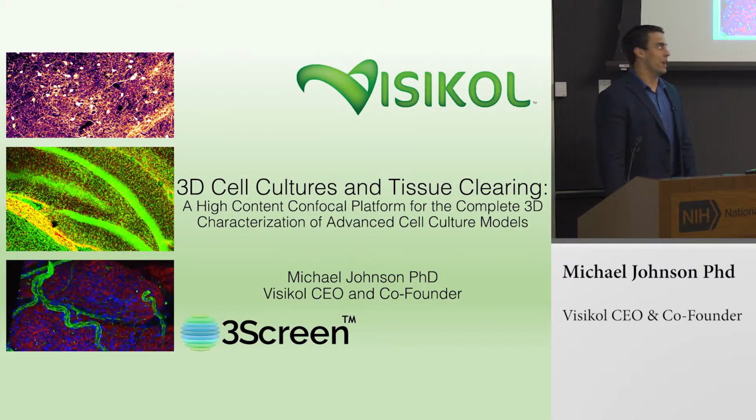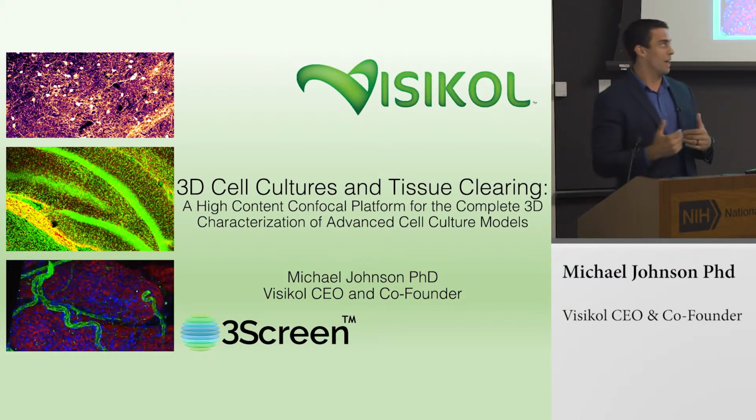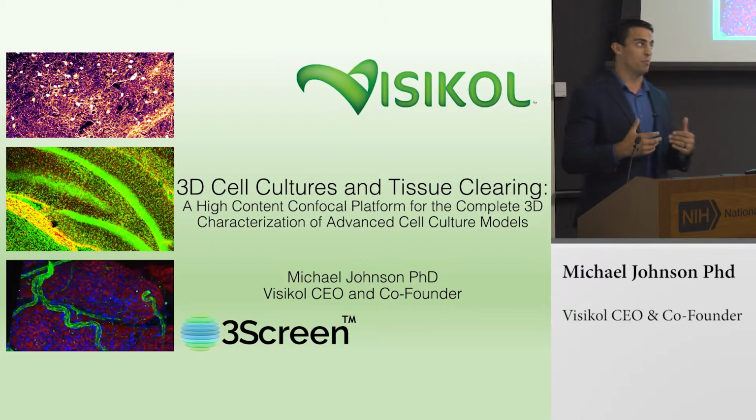So yeah, the presentation today I was going to go through is a high-level overview of 3D cell cultures, talking about some of the applications that our lab has worked on, and also diving into tissue clearing and how it applies to 3D cell cultures. It's something we've heard about in whole mouse brains, whole rodent brains, but how it's actually important to looking at 3D cell culture models will be a focus of this talk.